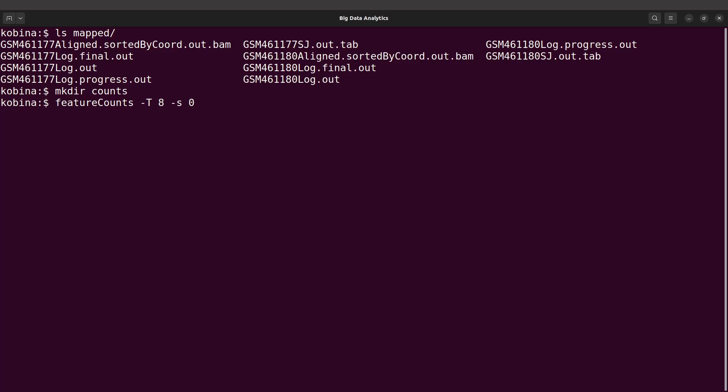With the strandedness, you can estimate it by visualizing the BAM files. If you visualize using tools like IGV, it's possible to estimate or identify the strandedness and use that to specify the appropriate value. There are also tools available that can help you estimate the strandedness. The Galaxy tutorial page that this tutorial is based on has a tool that allows you to estimate strandedness, so make sure to check that tutorial out.